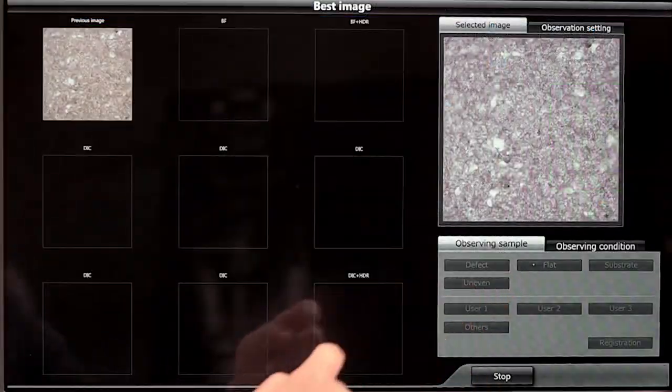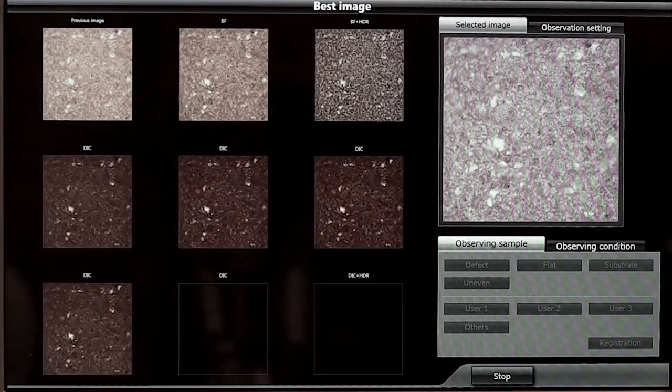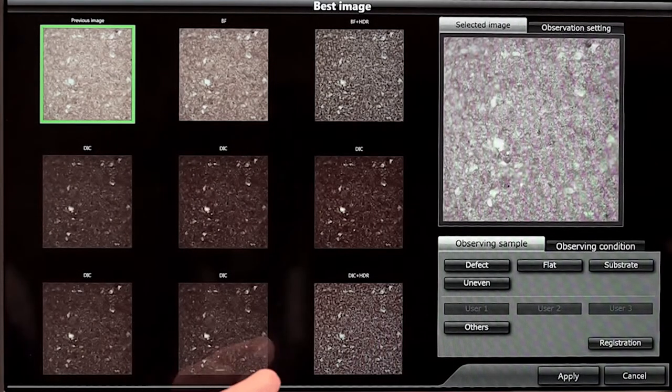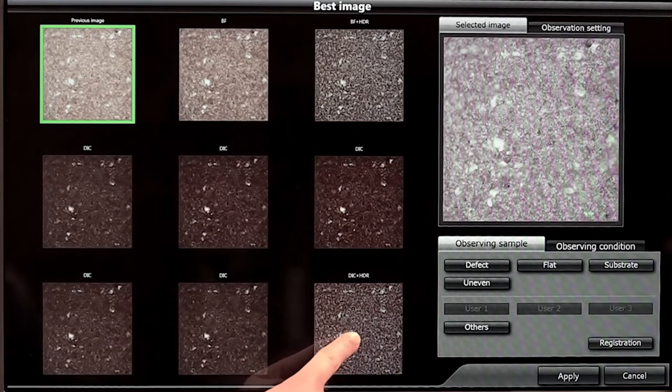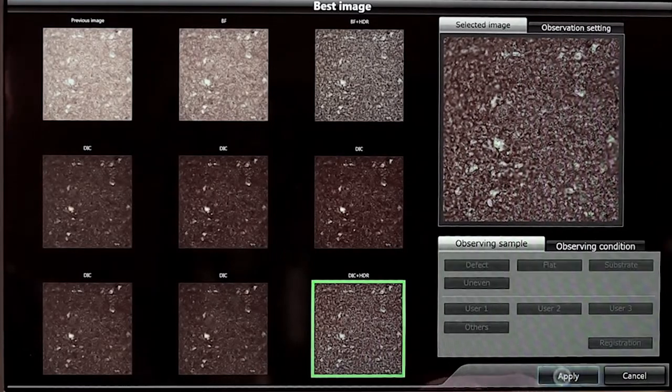Use the system's best image function to preview nine sample images and then select the best one with a tap. You can even lock in that setting for multiple samples.